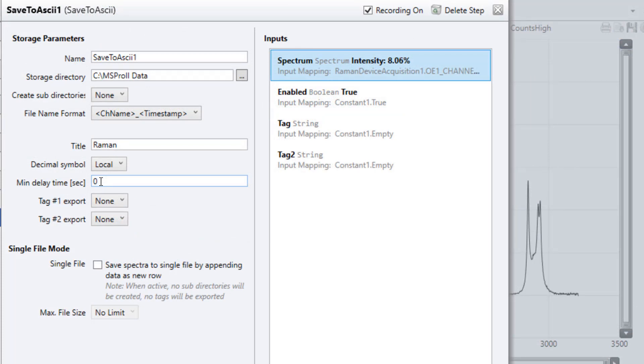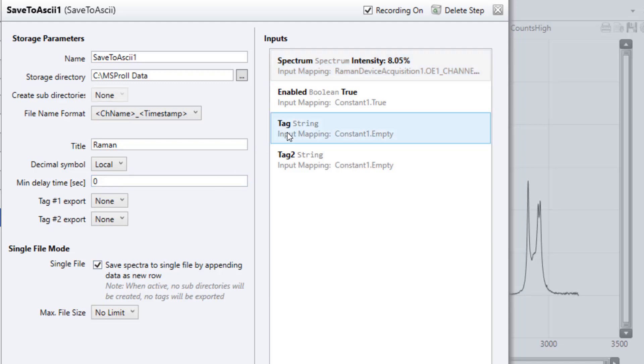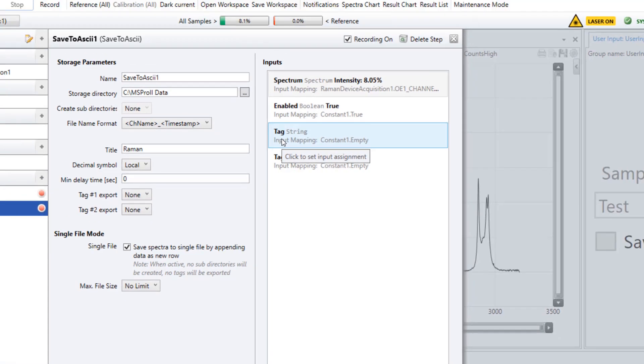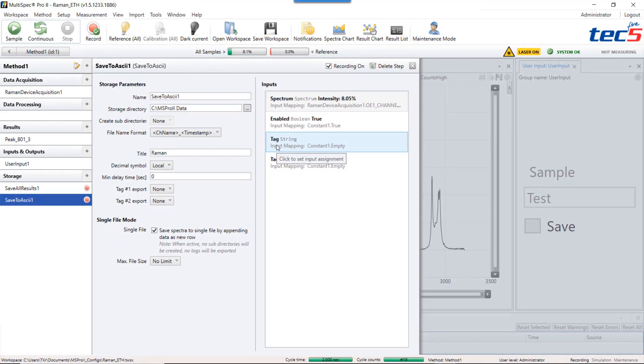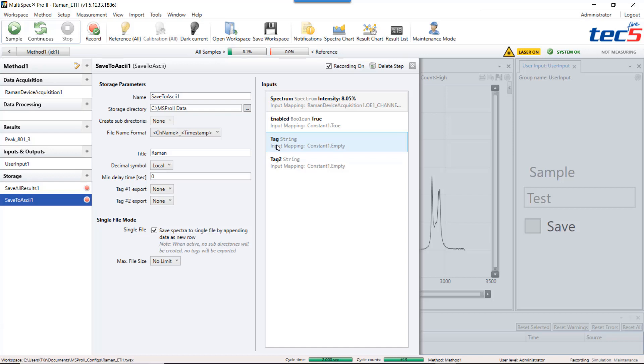If you do a laboratory measurement it can be beneficial to store the sample description and the spectra in a single file. You can do this by activating the checkbox single file. In the next step you have to assign the string item sample of the user input by a right click.